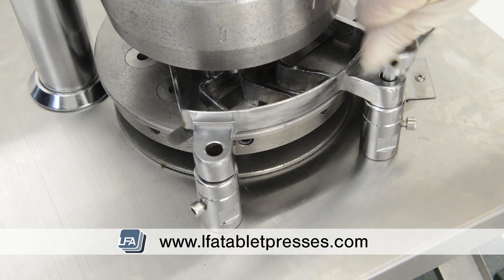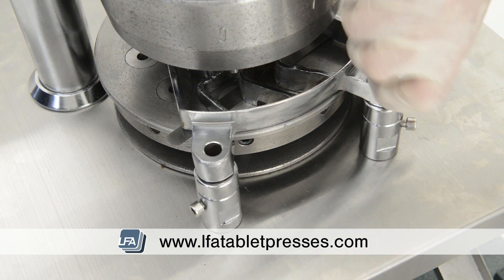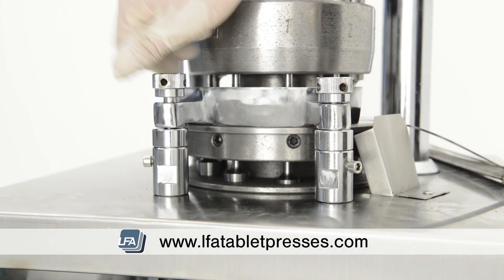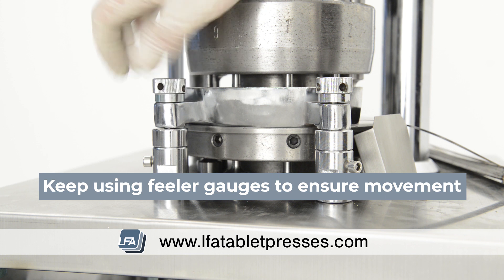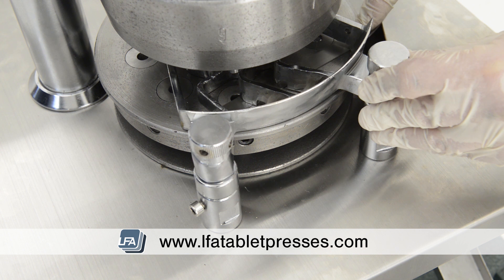Now replace the two feeder tray thumb bolts by hand. As you're tightening, you'll notice it slightly pulls the lower section of the feeder tray fittings upwards. Whilst doing this, constantly use the feeler gauges to ensure there's some movement. It will feel tight, but this is normal.